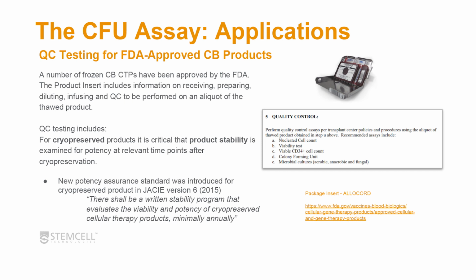They want to confirm that, though, if they've shipped it to you, typically that happens in cryo shippers, that if the temperature monitor says it's okay, that is probably a good indication that the product that you have in your hands is good. But assuming that you don't thaw it inappropriately and that it's thawed well, this assay can then really tell you at the end what the product that the patient got was and what was the stability and what was the potency of that product.